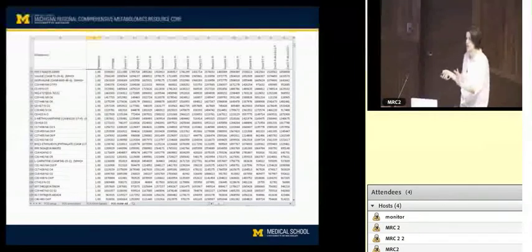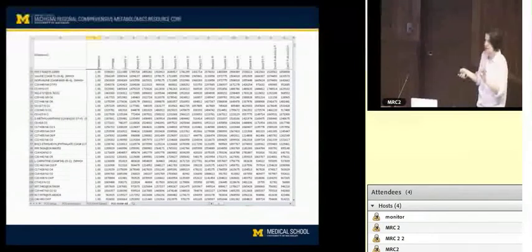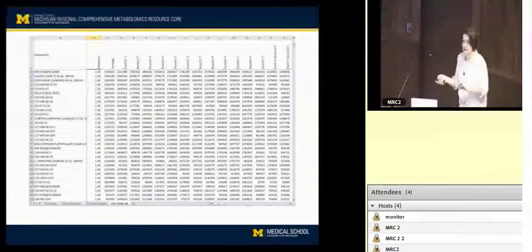And I say that because what we're going to see later on is that a lot of times some of the unknowns are really related to the knowns anyway, and you may or may not gain a lot more information from that. It's really important, if you're going to include all these unknowns in some sort of biomarker discovery, that you're critical and do some data reduction before you get to that point.